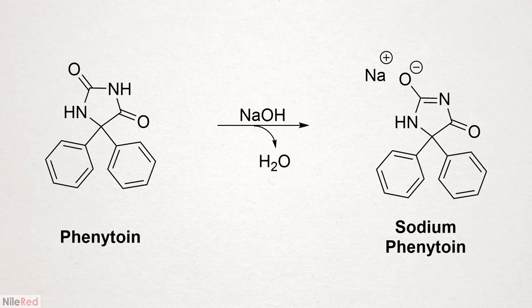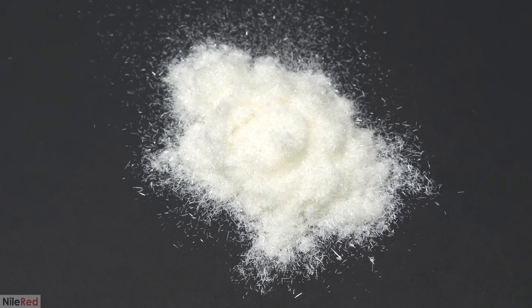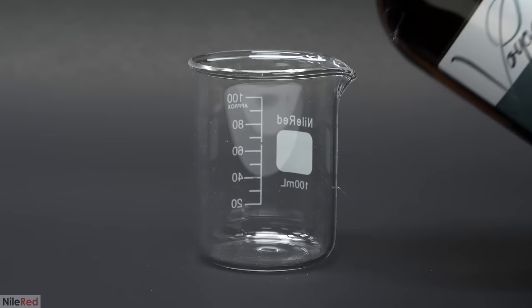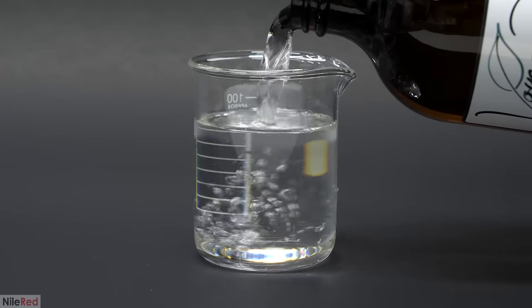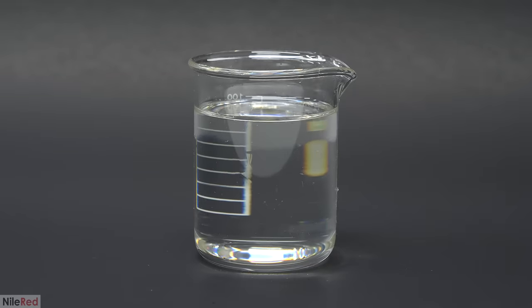If I were to convert it with 100% yield to sodium phenytoin, it would give me about 1.3 grams. The average daily adult dose of this drug is 300 milligrams, so what I have here is about 4 days worth. If I had used all the benzyl that I had though, it would have been around 8.